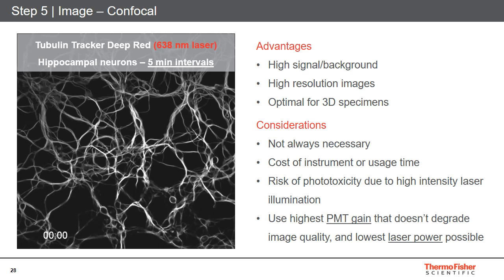So many times an experiment that requires a wash with a wide field system can be performed in a no wash type of workflow using a confocal system. So this is going to be an example of that, using that tubulin tracker deep red once again, but in this case we're actually taking images without performing a wash step using a confocal.